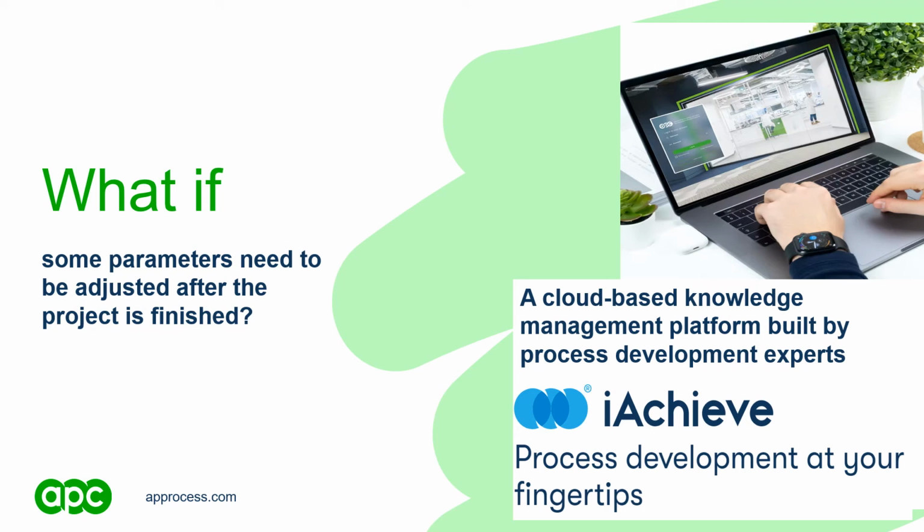And all experiments are contextualized. That means that each experiment is linked to one workbench item, and that item has to be linked to a project objective. So everything that we do has a reason to be done.